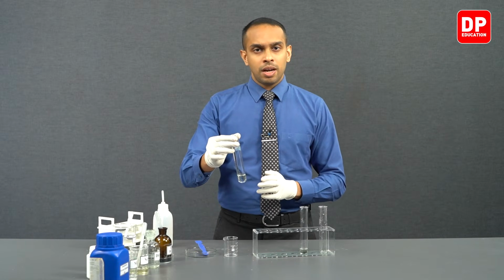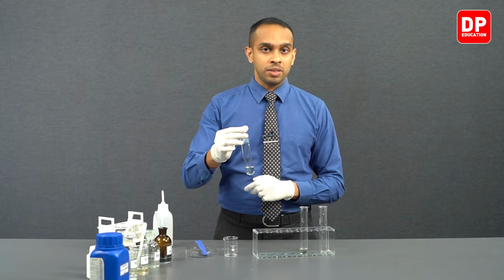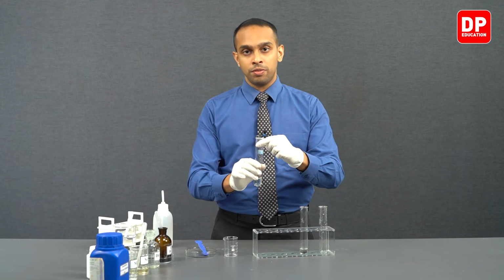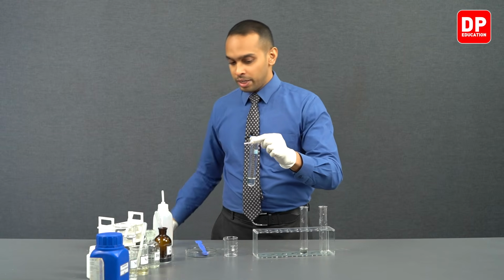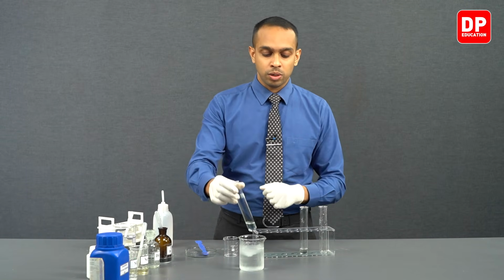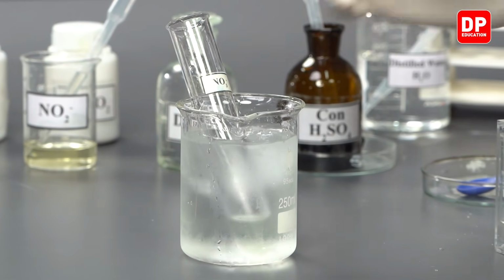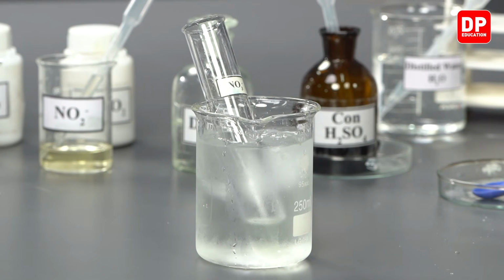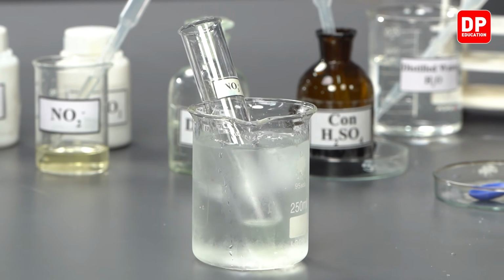After preparing our Fe2+ aqueous ion solution and transferring around 3 cubic centimeters into a different boiling tube, we are going to place this in a cold water bath or ice water bath to cool down, as when you are making this first solution mixture, you have to make sure that the Fe2+ and nitrate ion solution mixture is cooled before adding sulfuric acid.